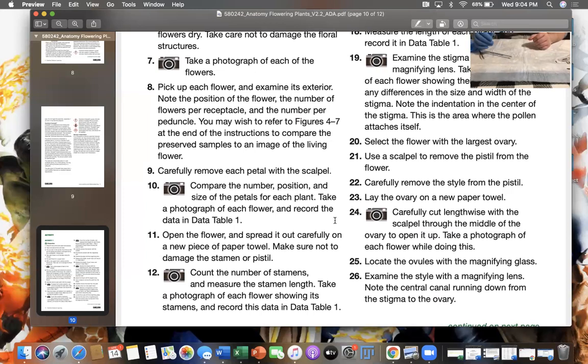Now things like ruler, forceps, that stuff, I would wipe them off with a Lysol wipe. That would be how I would clean them. Which we probably all have a ton of, thanks to the pandemic.